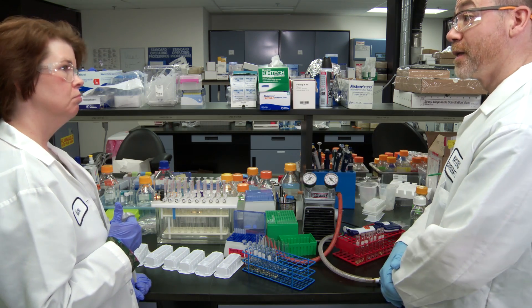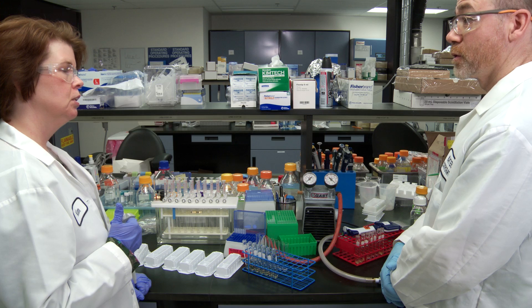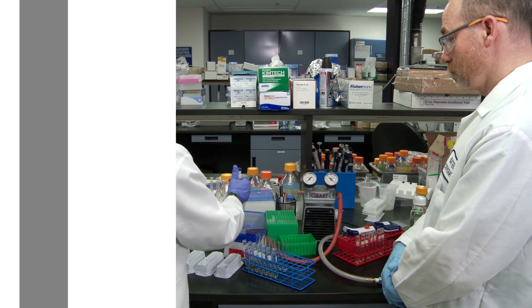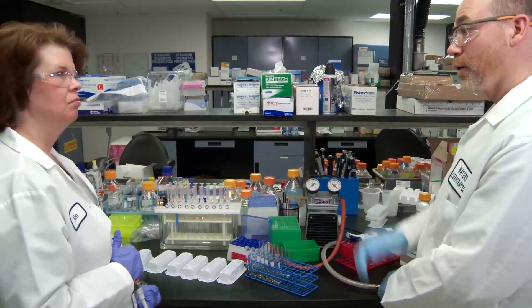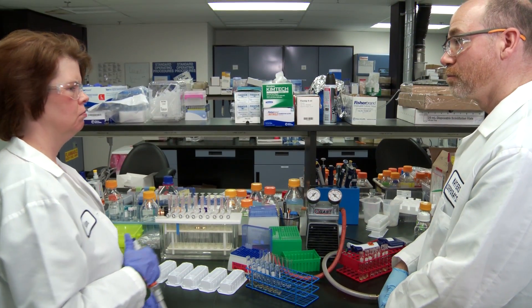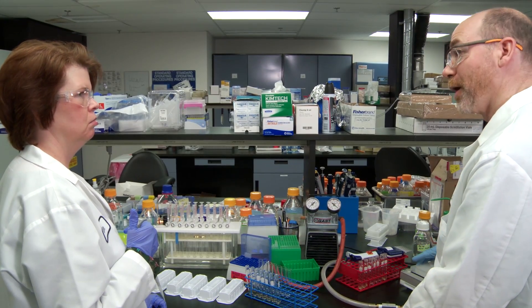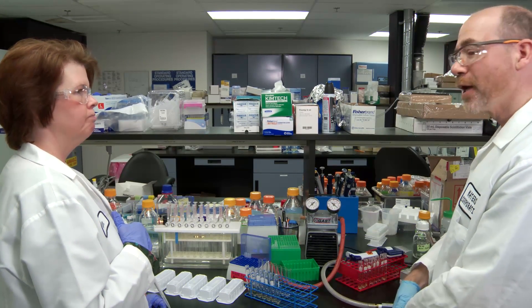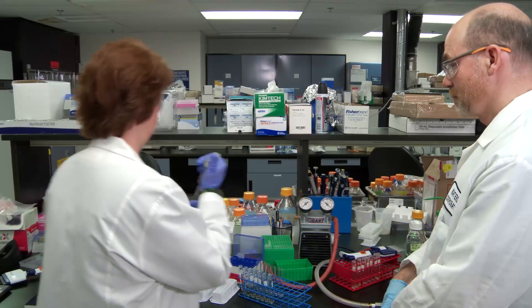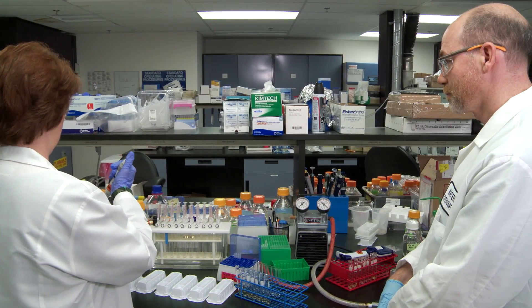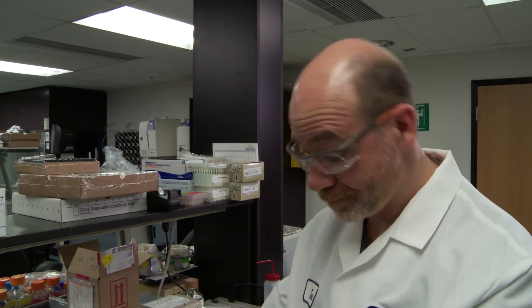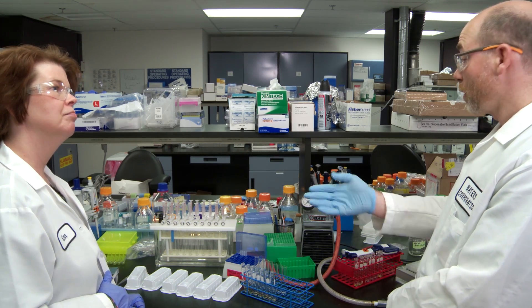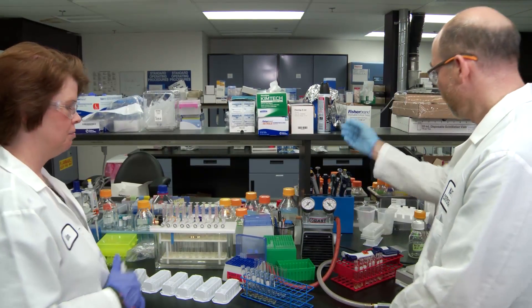Now we've got to load the samples, but first you need to condition and equilibrate all of your cartridges. Give me a minute. Now that that's all done, you need to load your samples onto the cartridges. What are you going to do? Remember, I already loaded mine — but I'll wait. Okay, now that everything's loaded, we can go ahead and load them onto the sorbent. Ready? Let's go.